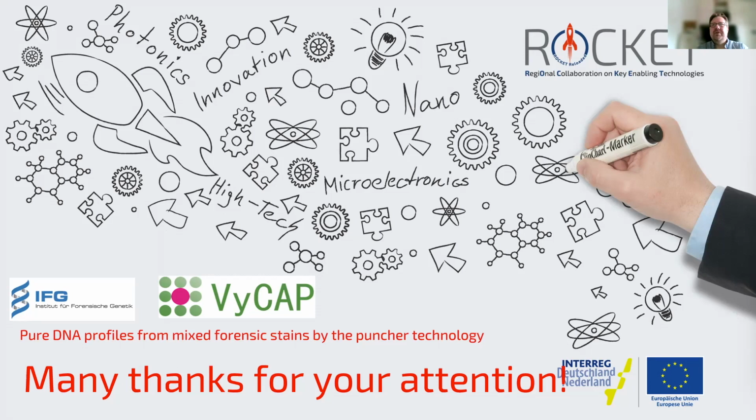The main issue is the size, the pure size. It has a size distribution, of course. The majority might be too large for the wells that we use. And so we think of adapting and changing the microchip as well. But it's more difficult than other aspects of the workflow.